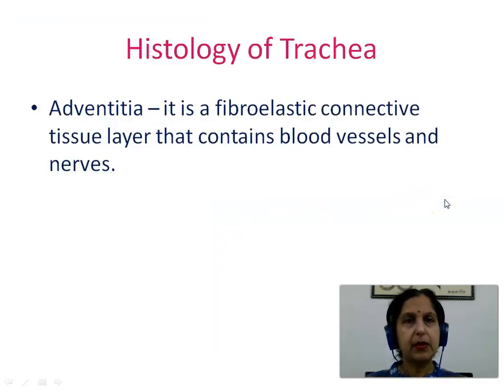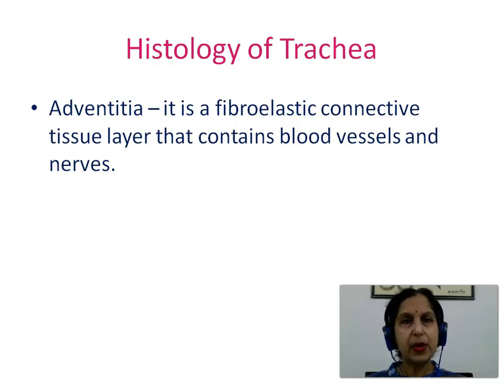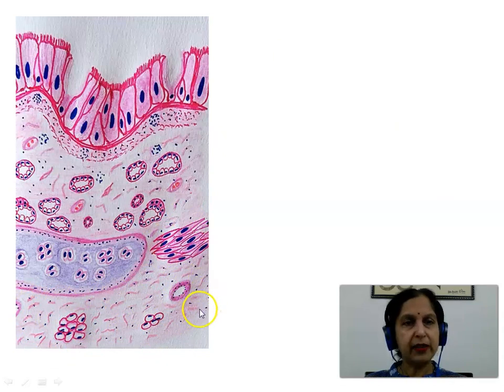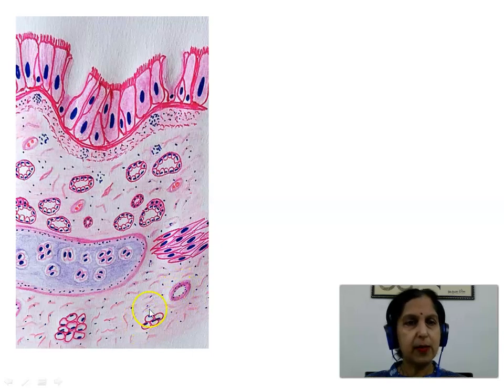We next see the adventitia. This is the fibroelastic connective tissue layer that contains blood vessels and nerves. It is the outermost layer of the trachea. Here we see the adventitia made up of fibroelastic tissue showing blood vessels, adipose cells, fibers, and nerve endings.